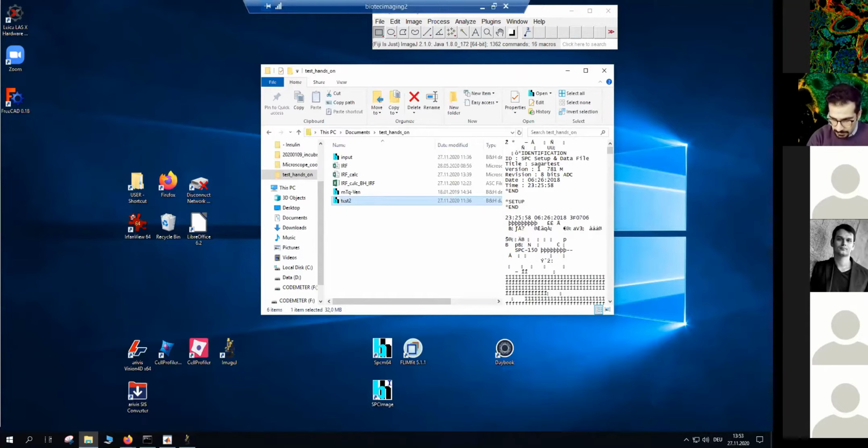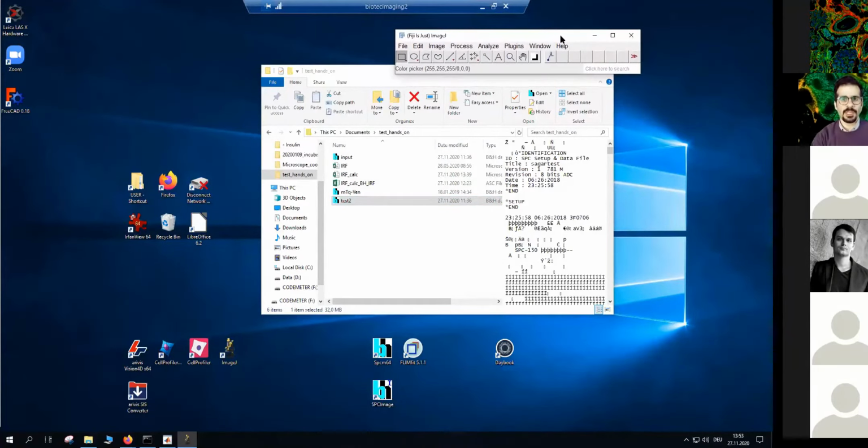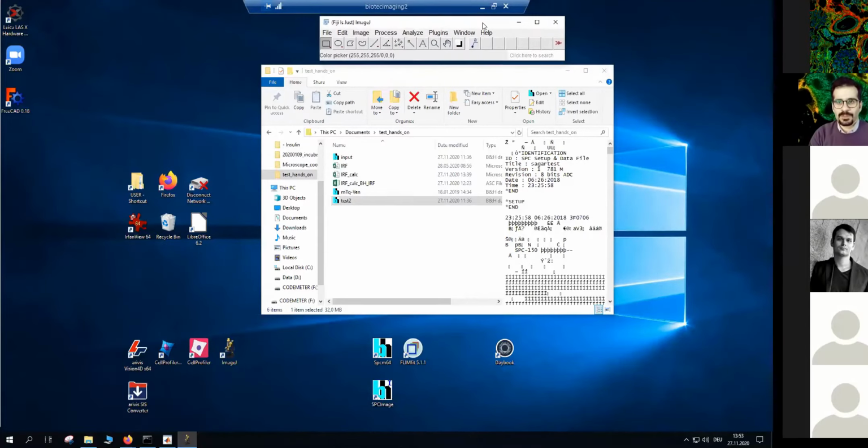Okay. Yep, sure. And so here it is. It's our famous Fiji imaging. Fiji is just ImageJ. This is a comprehensive tool, and I am afraid if anybody is working with microscopy and bioimaging and doesn't know this tool, they should spend as much time as needed to learn about it. I'm really in love with Fiji.